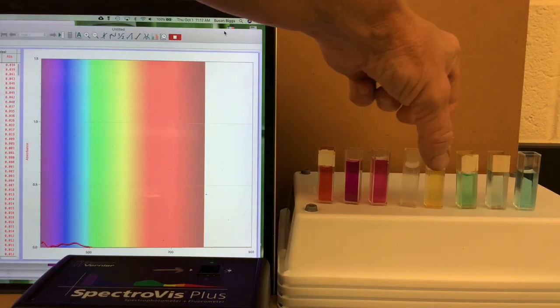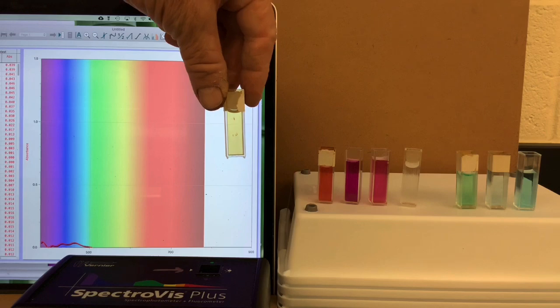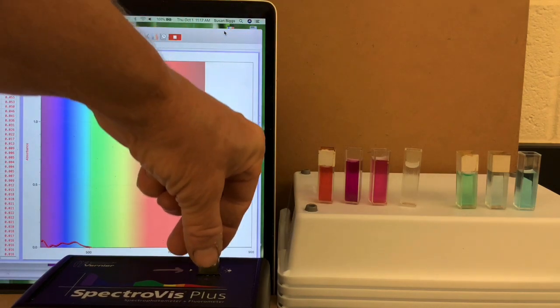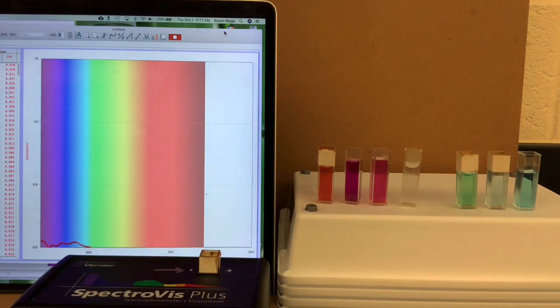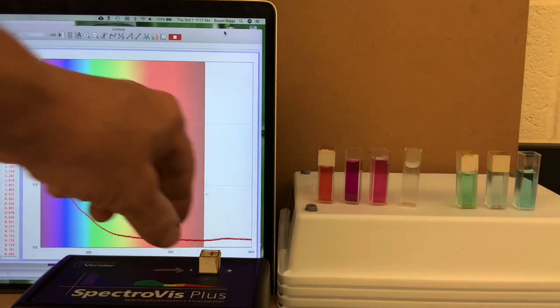Next, iron, which is yellow colored. Notice what color of light it absorbs most strongly.